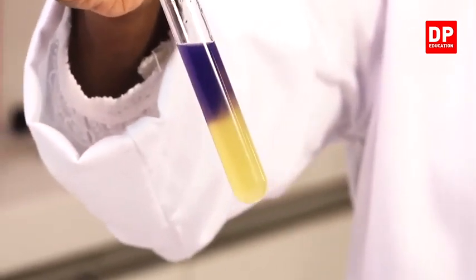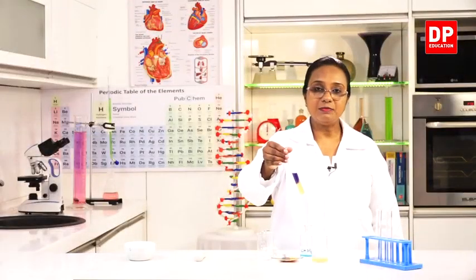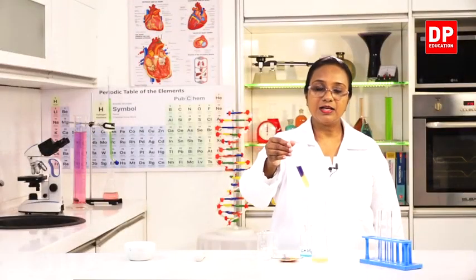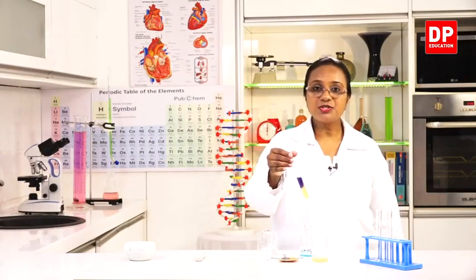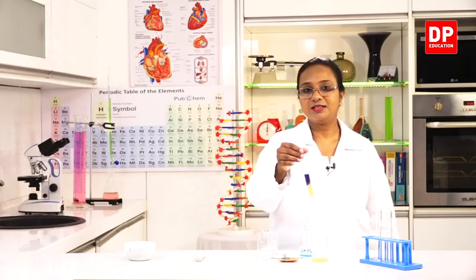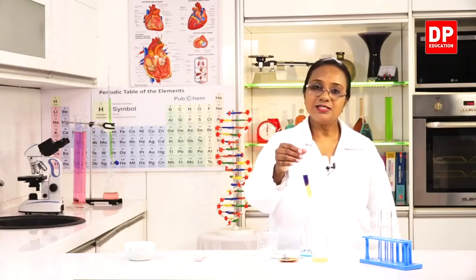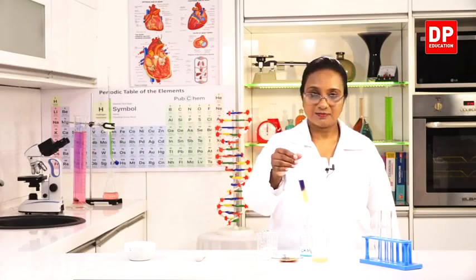So, with sodium hydroxide and copper sulfate, if a purple color appears, that means that sample contains protein. And you know, students, what is the name given for this test? Yes, this test is called the Biuret test.